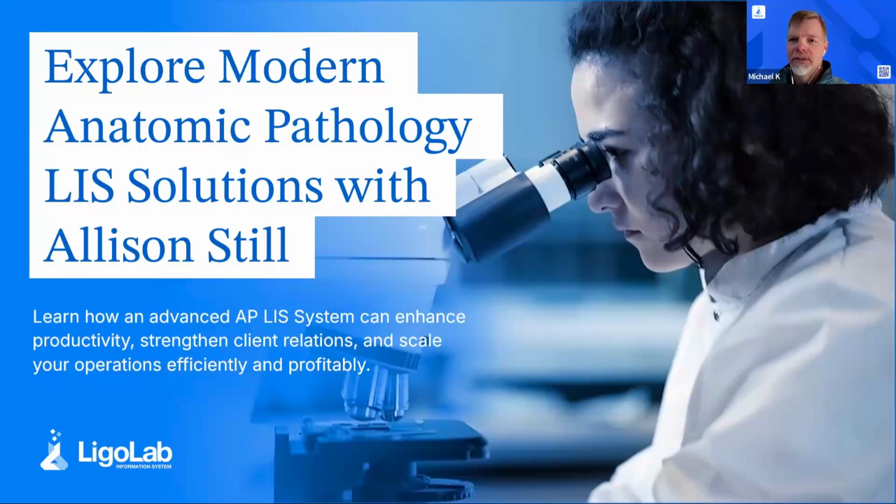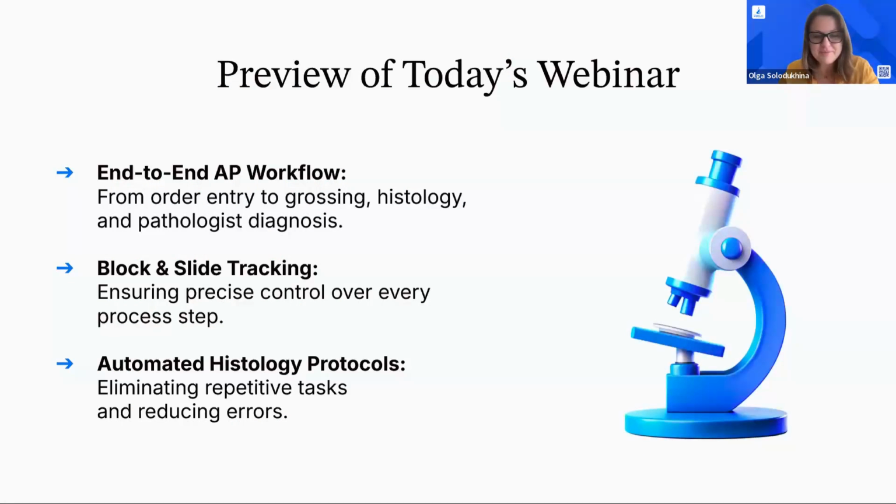Olga, hello to you. Please, a quick little introduction about yourself too. Hello, everybody. Yeah, my name is Olga. I'm the head of sales and marketing at LigoLab. I've been with the company for a little more than 2 years now. Primarily working with the clients on helping them find the right solution, and I'll touch on some of that stuff today as well. So whenever you need help finding a new LIS, you probably will meet me along the way. Perfect. Thank you for taking the time to join us today.